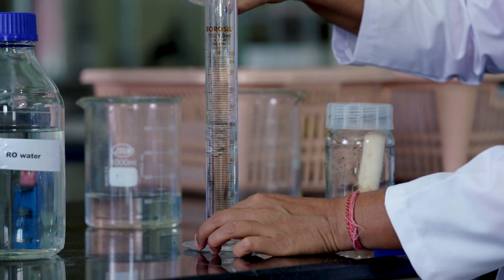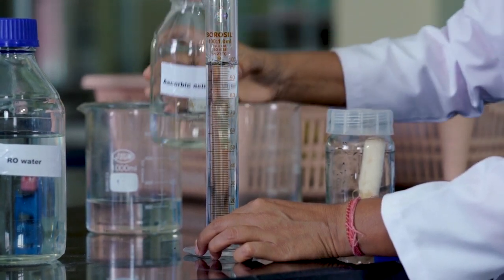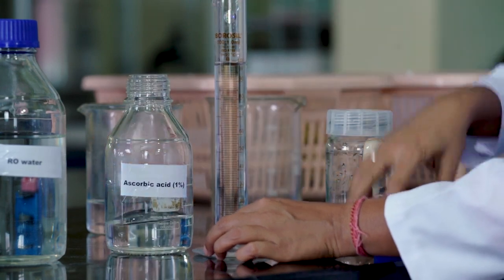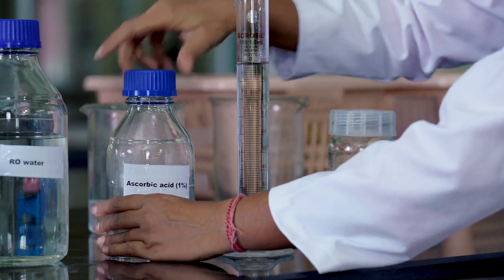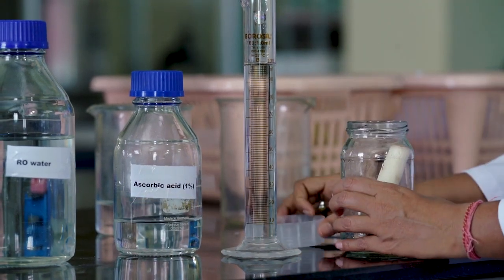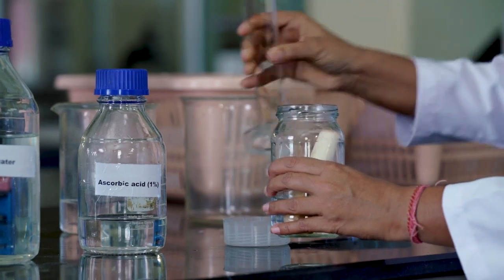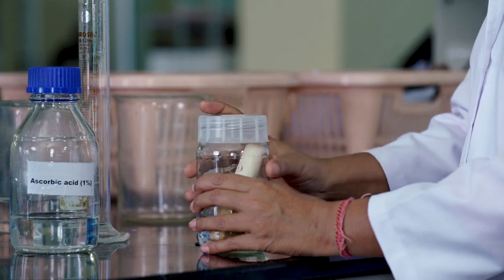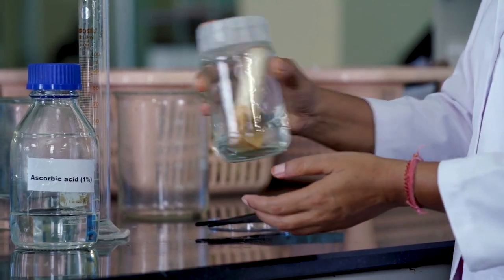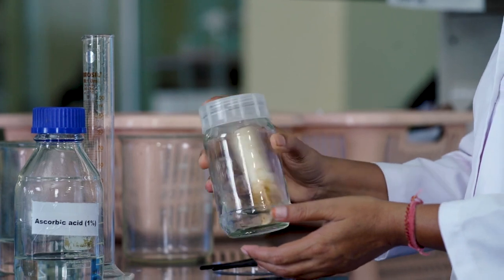We will be measuring 100 ml of ascorbic acid solution and we'll treat the explant with it. The treatment will be carried out for 2 to 3 minutes. After that, the explant will be washed using sterile distilled water or sterile RO water.